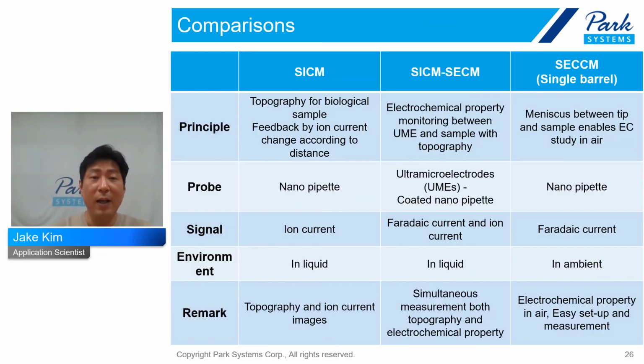Among nanopipette-based SPM techniques, each technique has its own characteristics, and a proper technique should be selected and measured according to the measurement environment and purpose.